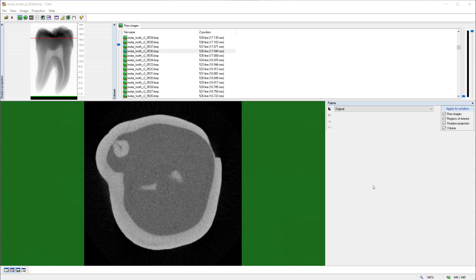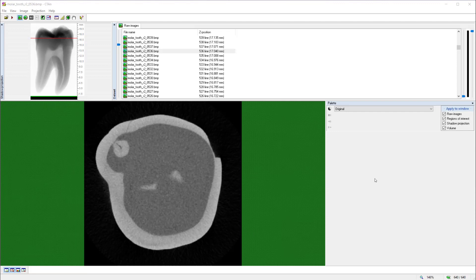Hello and welcome to today's Bruker MicroCT training video. The subject of this video is an overview of CT Analyzer.